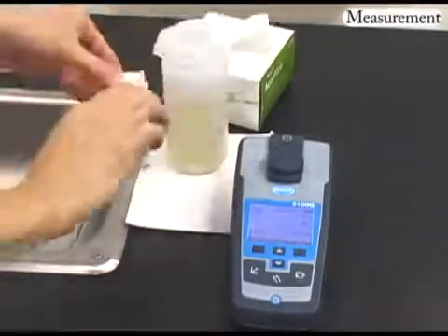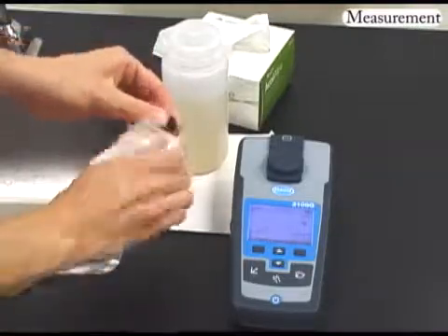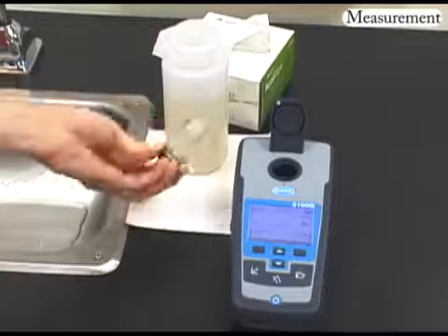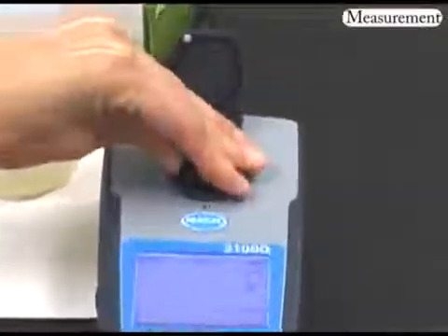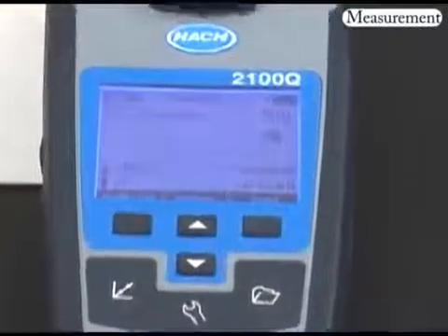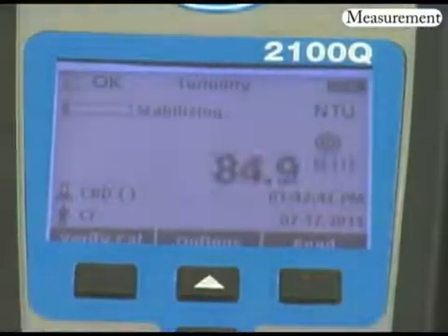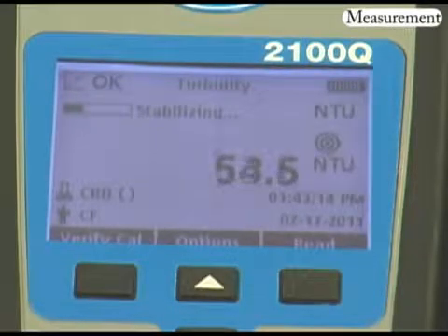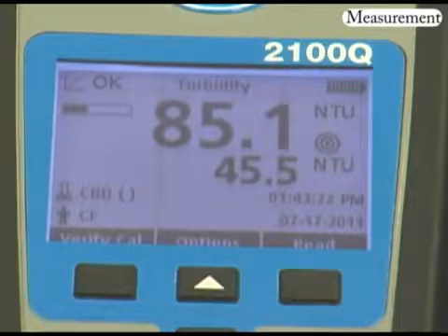Hold the sample cell by the cap and wipe clean with a lint-free cloth. Invert the sample cell a few times, insert it into the cell compartment, and immediately press the read key. The 2100Q shows the calculated RST value while displaying intermediate results below.